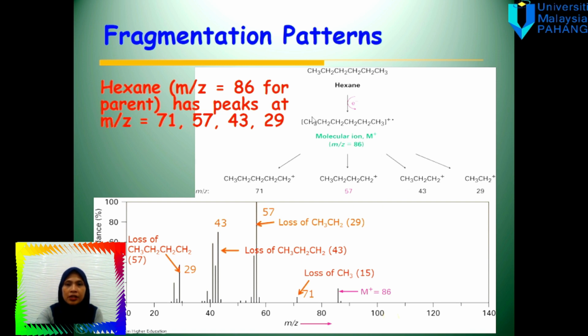You see the initial molecule is written down as a radical cation, followed by the different fragments. For the fragments, you have to show what appears in the mass spectrum, always writing the m/z value below the cation. For the radical, there is no need to write down the mass, just show it in the fragmentation pattern.